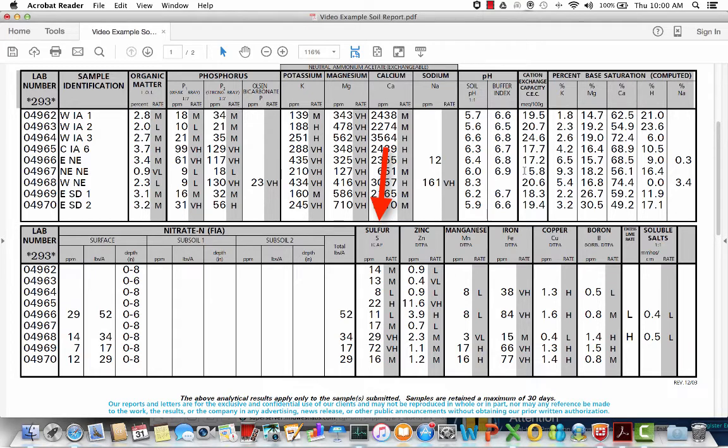As we get down to the western Nebraska soil, we see a fairly high sulfur value of 29. We probably would hold off on making a rec on that. Again, I think every grower's got to think through their yield expectations, and again, because sulfur is a mobile nutrient, they might think a little bit about some in-season application, especially if they're doing in-season application of nitrogen as well.